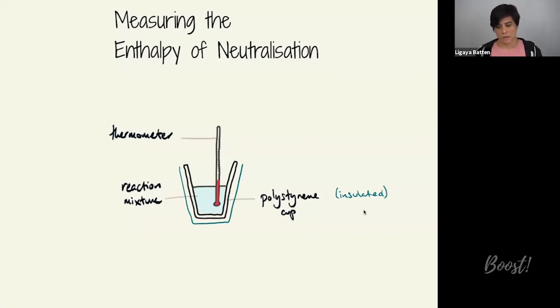Other things, and we're going to talk about this more in a second, thinking about sources of error. Other things you may also see in your equipment setup is a lid being put on top of this polystyrene cup.